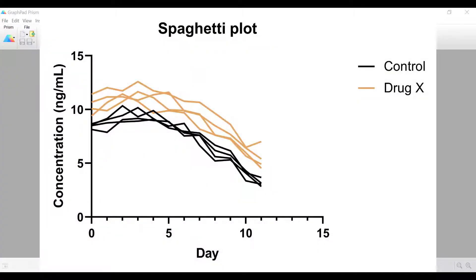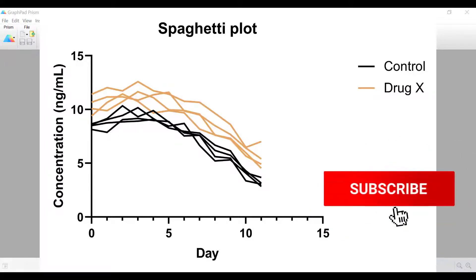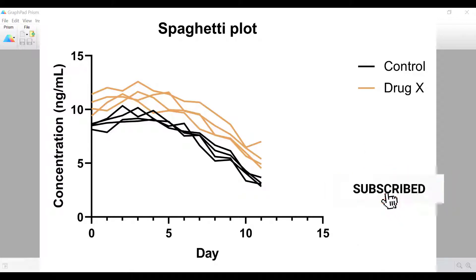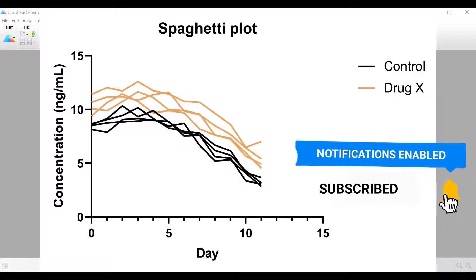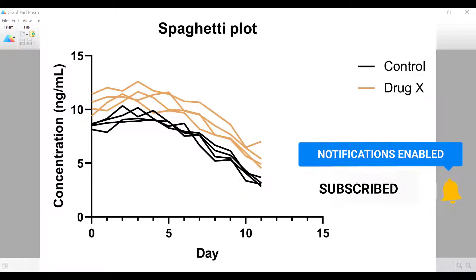A spaghetti plot is a type of line graph that commonly presents longitudinal data showing individual traces for each subject or another experimental unit. In Prism there are two variations of the spaghetti plot.